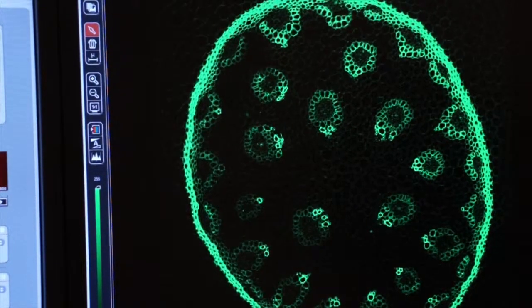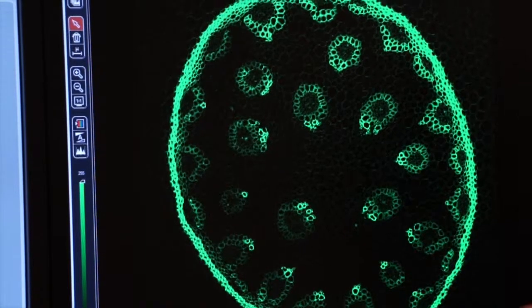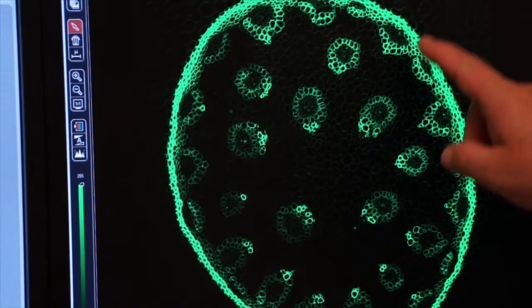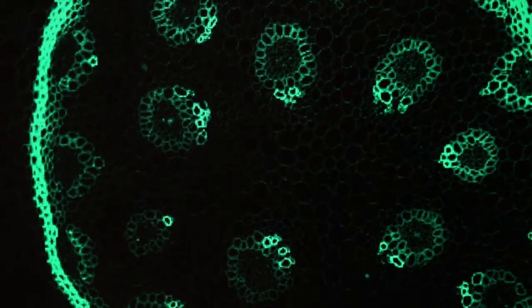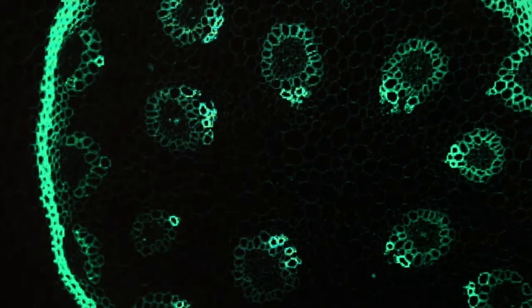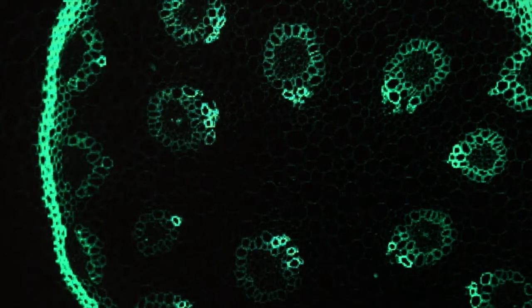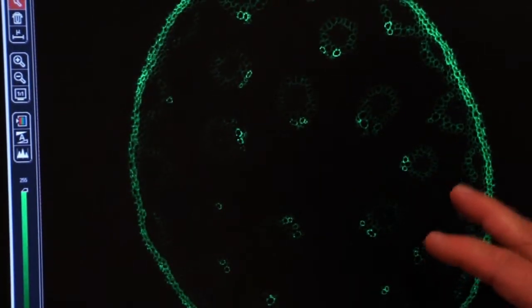You can see that it's still accumulating. The image is still being captured, and maybe if your eyes are sharp enough, you can watch the refresh scan go down through the image, and now it's done capturing the image. And so that's a lot brighter than when I had 1 accumulation, which we'll do again, fast capture of an image, but low light level. So accumulation increases the brightness of your image, but it does it at the expense of adding noise.